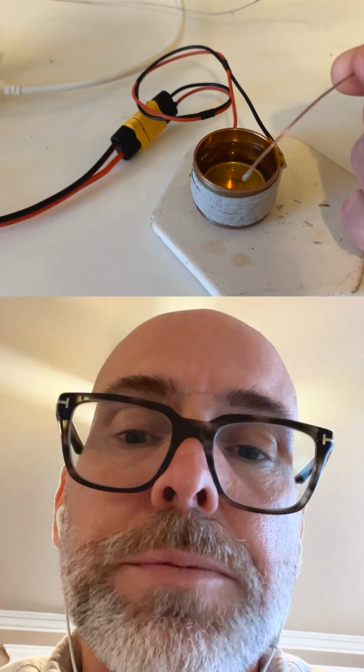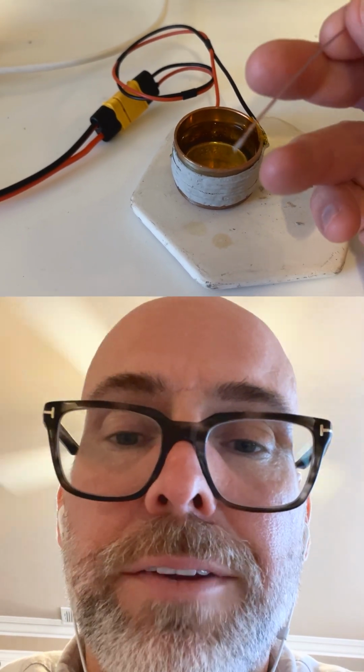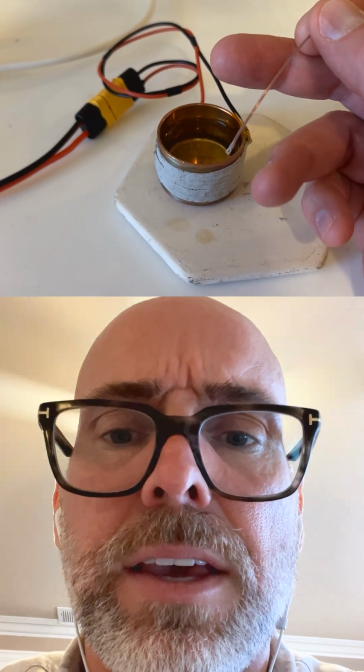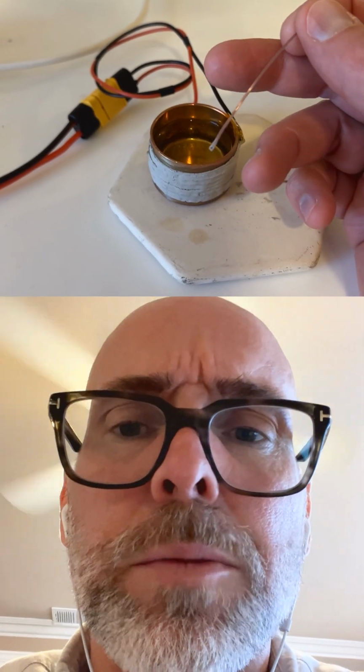So I don't know. There were different options. There are insulating sheaths that kind of protect it. But I actually found a very simple thing that has very low thermal resistance: coating it in a little bit of silicone. The silicone can handle the liquid nitrogen and the temperatures we need, and so that's been working really well.